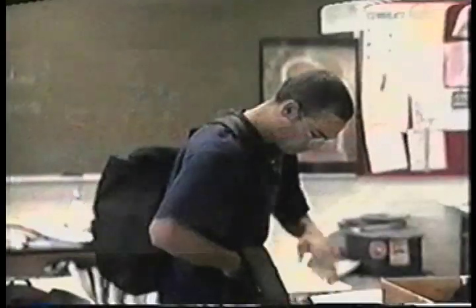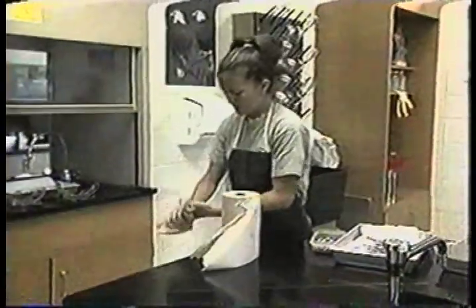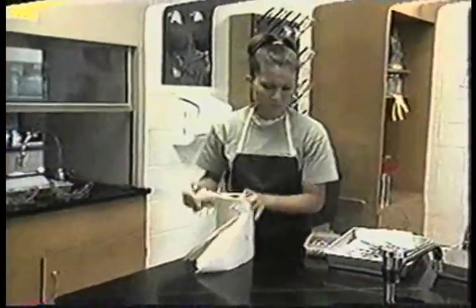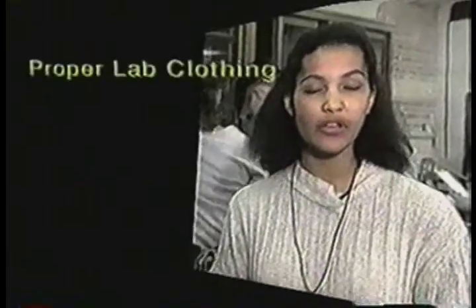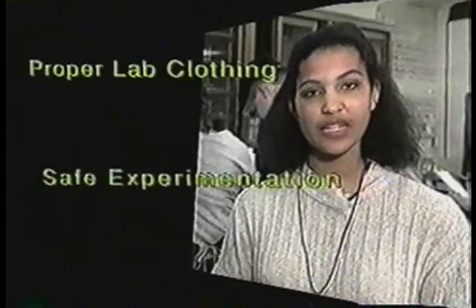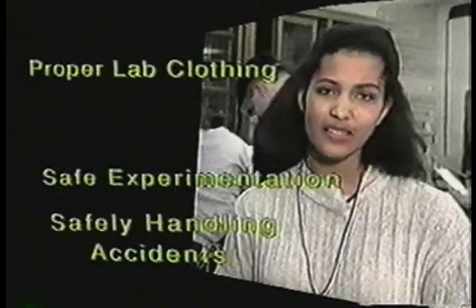Safety checklist. A student dons a lab apron. Another scrubs her arms. Yes, safety rules may sound like a boring checklist that's going to waste your time, but it won't. It's a smart checklist that could save you and your partner a lot of trouble, and maybe even keep you two from becoming seriously injured. As part of that checklist, we're going to tell you the do's and don'ts of lab clothing, outline safety cautions that everyone should be familiar with, and tell you what to do in case there's an accident.